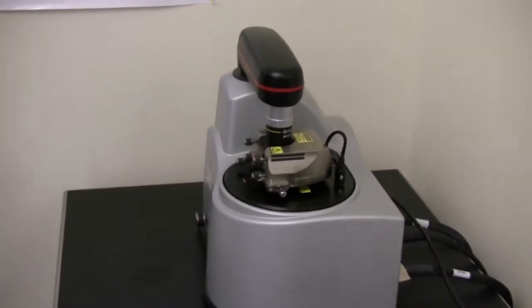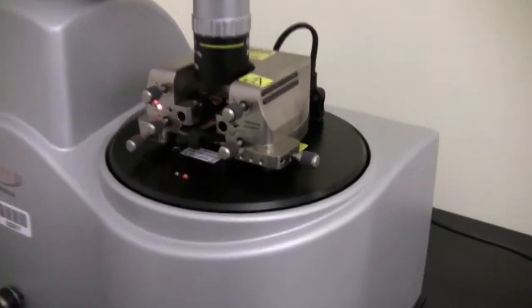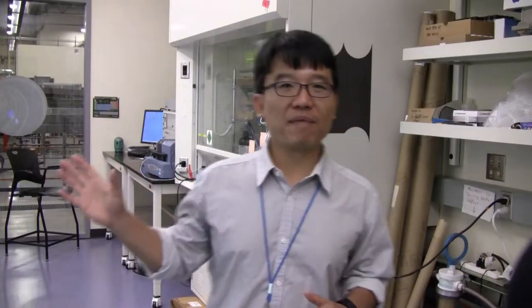We have, for example, an atomic force microscope. We can look at the nanostructure thin film, and that could be useful for solar cells.